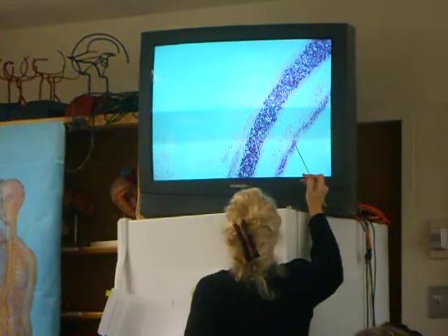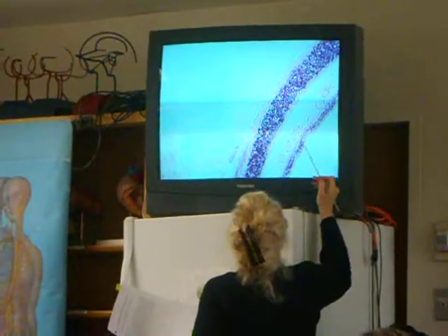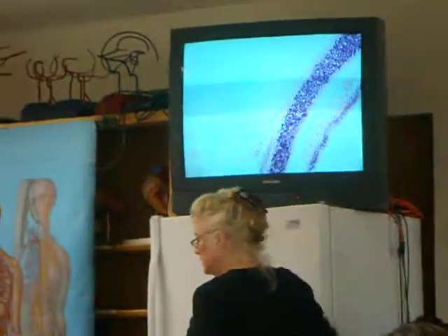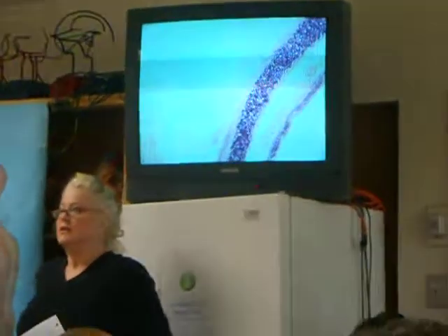So first, where we see that PCCE, or the ciliated pseudostratified columnar epithelium, that's the lumen of the trachea, right? So the bottom right corner is the inside of the trachea. And so lining that trachea, we know we have those cells with cilia, but we also have cells that are making mucus. So those are the goblet cells. And in some slides, I'm sure there's someone at this table that had a really good example of goblet cells. They're like bubbles that are in there.